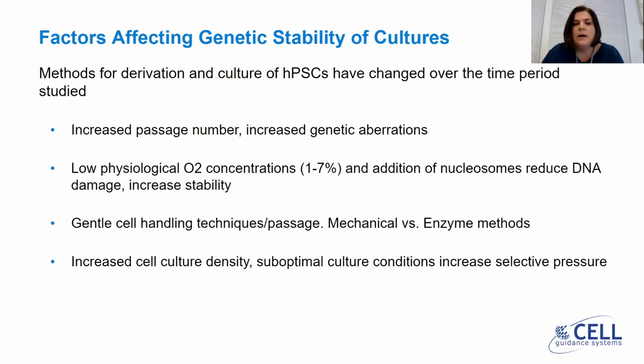When we were talking about how the frequency of 12p has decreased, we wondered whether this is because gain of 12p is often manifested in the form of an isochromosome 12p, and that tends to be something that's present at quite low mosaic levels.